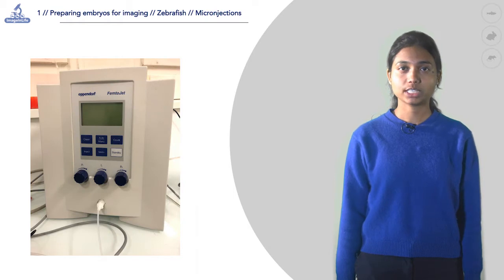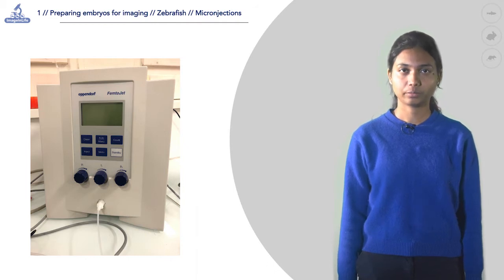We use a Femtojet injector from Eppendorf which uses air pressure to deliver the macromolecules filled in the glass needle into the embryo.